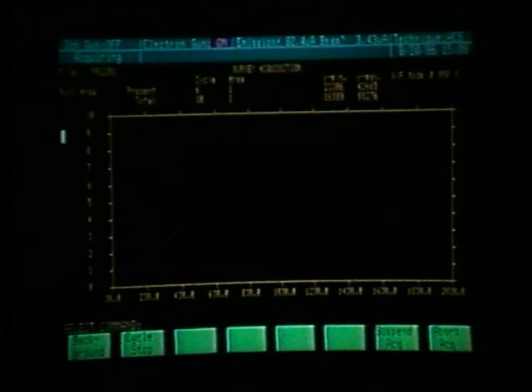These things need to be planned ahead of time before we set up for the profile. Once we set up the elements we are going to follow in a profile, we cannot add or delete any elements once the profile has begun.